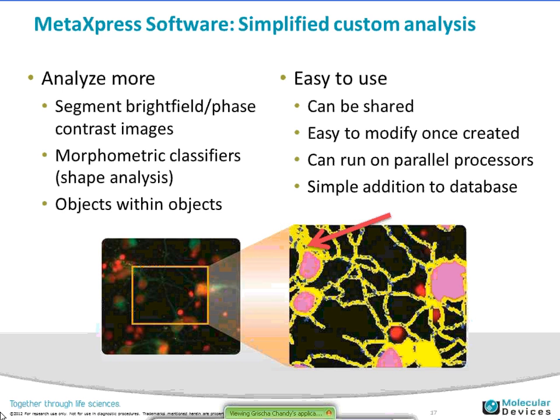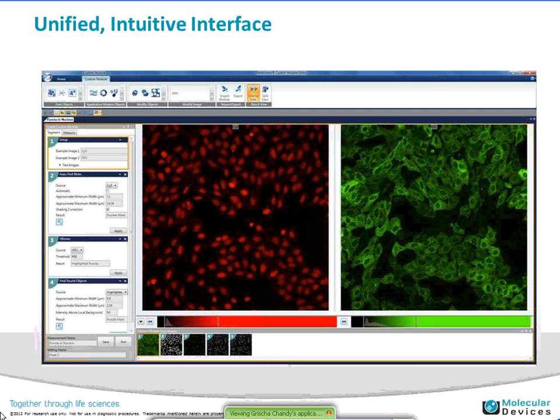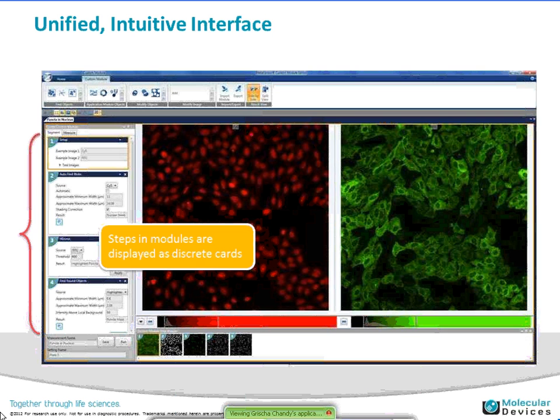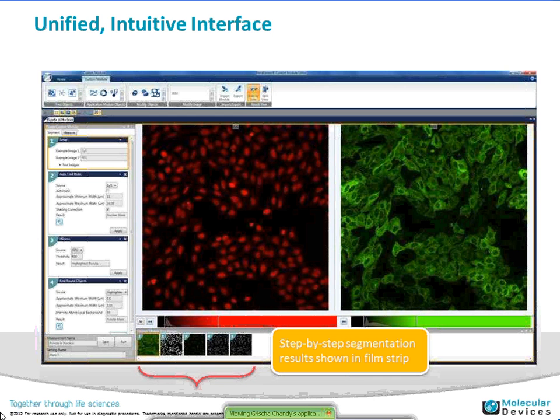The interface for the custom module side of things is a unified, intuitive interface. You can find your segmentation tools at the bottom and at the top in a ribbon. As you create steps for a module, they show up as discrete cards. Once you've ordered the cards, you do not need to recreate them — you can go in and change parameters inside that card, and you can see your step-by-step segmentation in the panel below so that you don't have to run a macro completely and then see your results. You can see what's happening as you go.